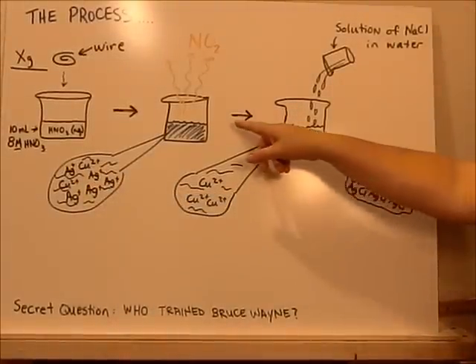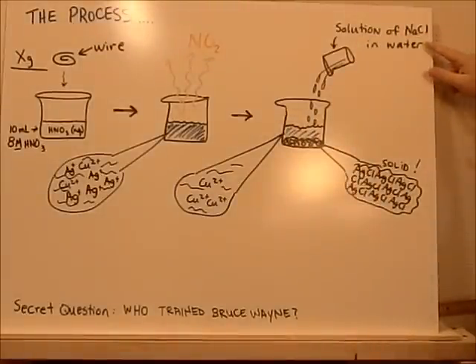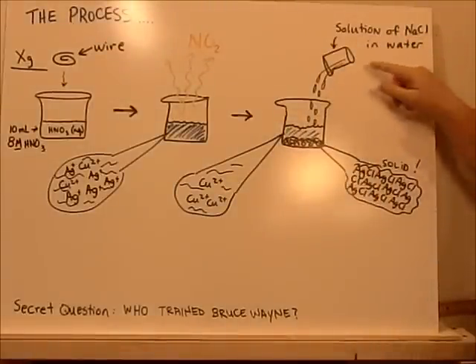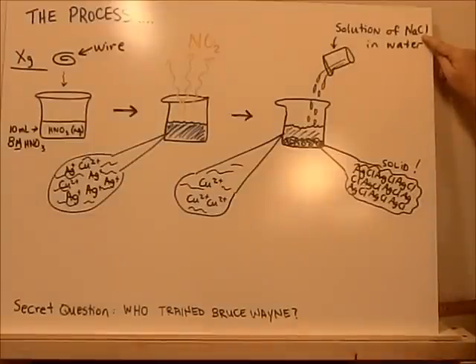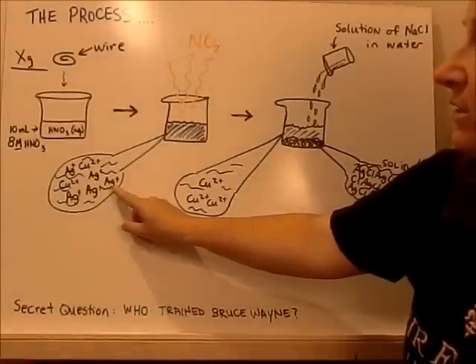The next step is that you're going to add a salt solution. So a solution of just sodium chloride and water. And you add it right in there. What happens there is that the Cl in NaCl really, really likes the Ag that's in the water.